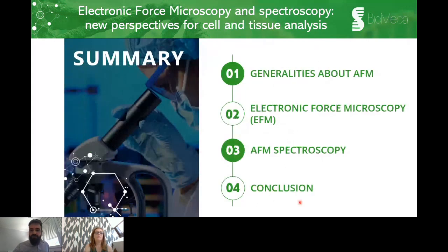Firstly, I will introduce you briefly the AFM technique and what we can do. Secondly, I will present you the EFM technique in 2 very interesting papers and the results obtained by BioMeca innovation team on hair structure treated by tensioactive ingredients. And finally, I will end this webinar by a very interesting field, the spectroscopy, project developed by BioMeca to quantify the CXCR4 protein in proteoliposomes.